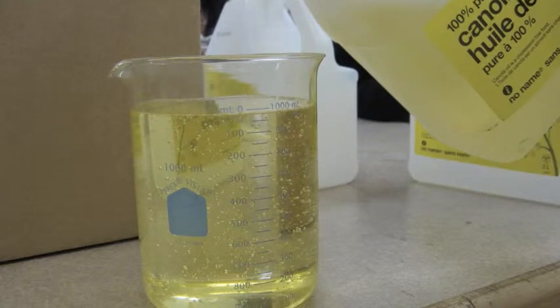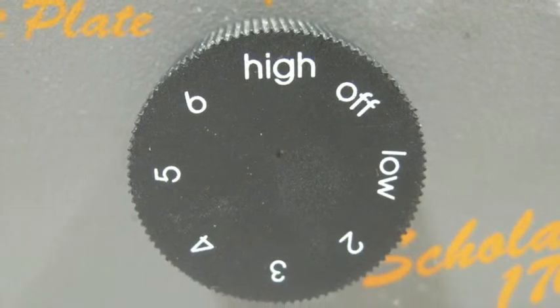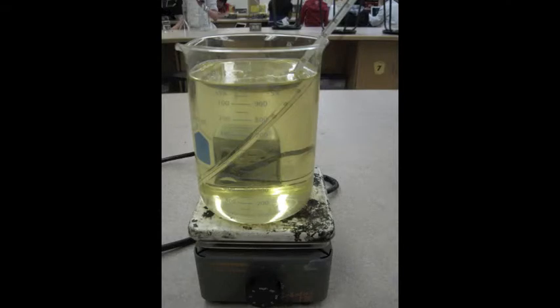Measure out 1 liter of canola oil into the 1-liter beaker and set it on the hot plate at high. Use the thermometer by placing it in the canola oil and waiting for it to reach a temperature of 50 to 55 degrees Celsius before removing.